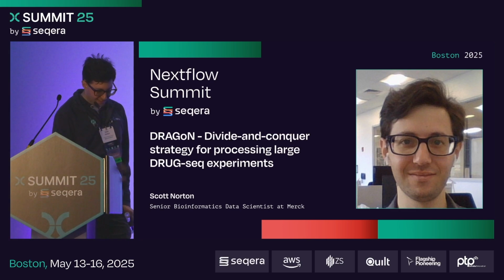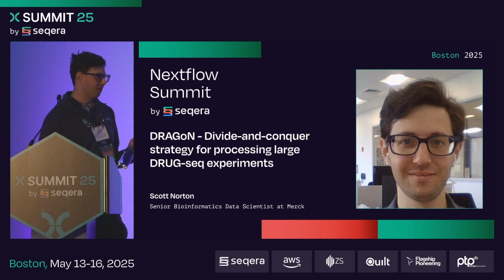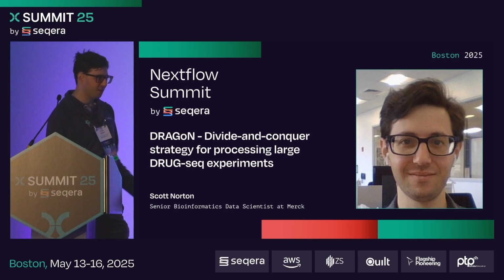and that's an interesting point that you bring up with DESeq2. One of the features that DRAGoN has is that it's able to generate fractional counts, which DESeq2 also doesn't really like. You'd have to coerce it to integer. Now, you could load in the dense matrix, which is a TSV file, coerce it to integer and load it into DESeq2. You could also load it into edgeR as is, and use that edgeR limma workflow.